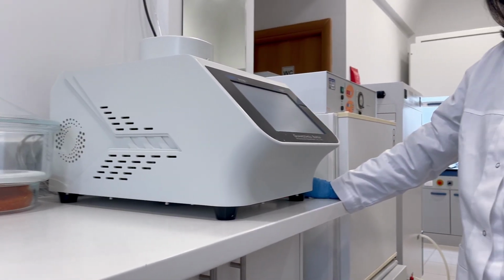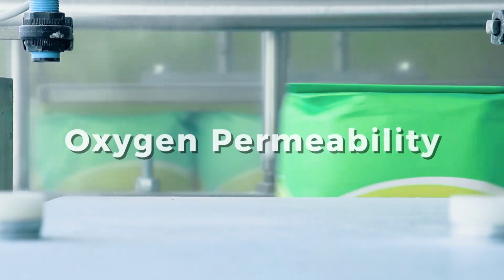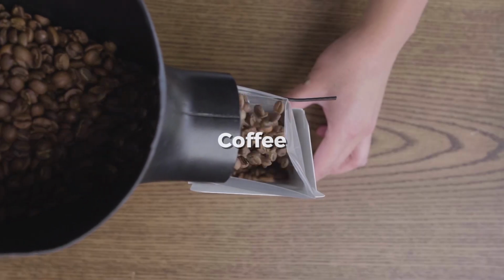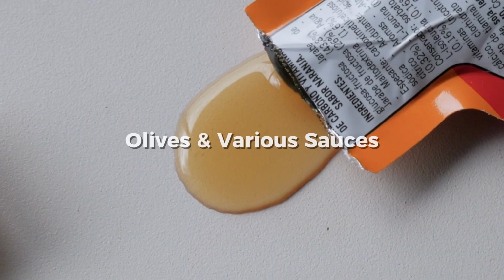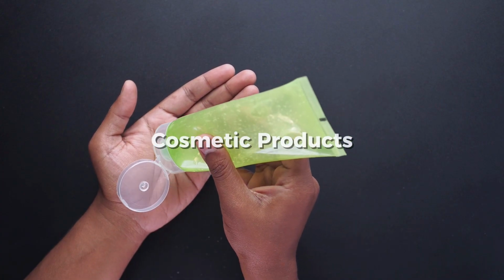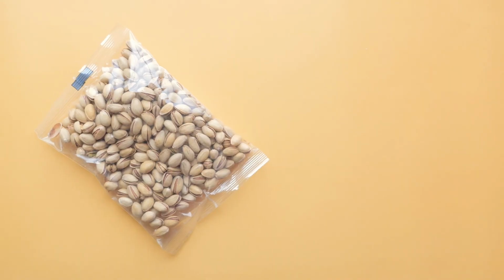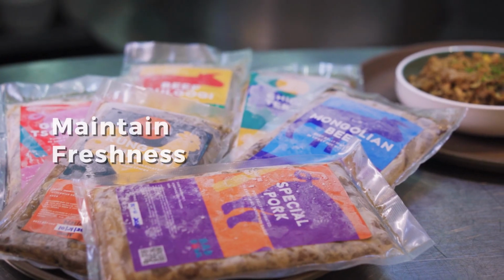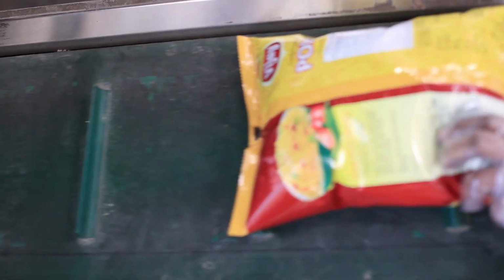The purpose of this analysis is to evaluate the oxygen permeability of a flexible film. Many food products, such as coffee, dry nuts, olives, and various sauces, as well as cosmetic products like facial creams and rinse-off formulations, must be protected from oxygen to extend their shelf life and maintain their freshness over time. One of the primary functions of the packaging material is to prevent oxygen from coming into contact with the product.